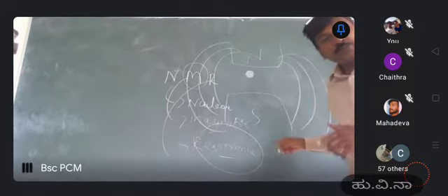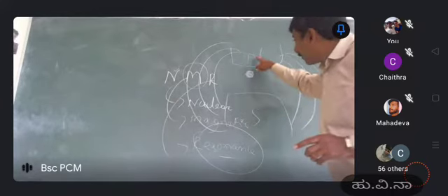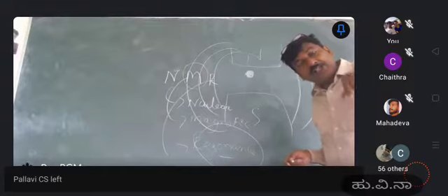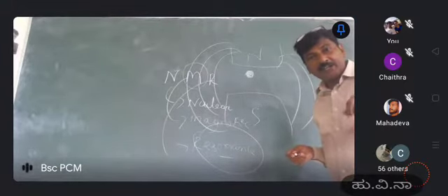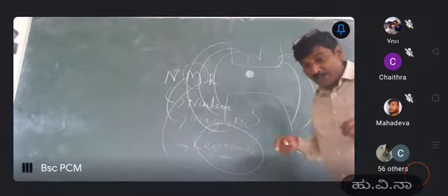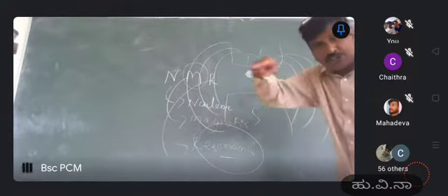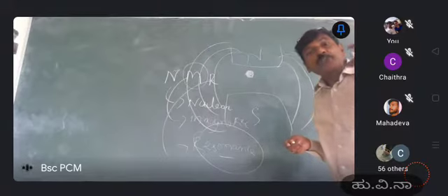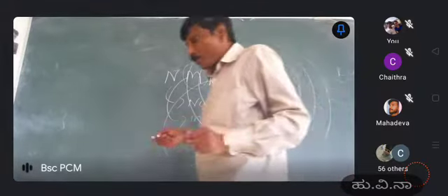When it is possible, the magnetic field is kept around the nucleus. Your nucleus also acts as a magnet because it has a positive charge and it is spinning. Due to the continuous spinning, it possesses spin angular momentum. What is spin angular momentum? I am going to call it P.